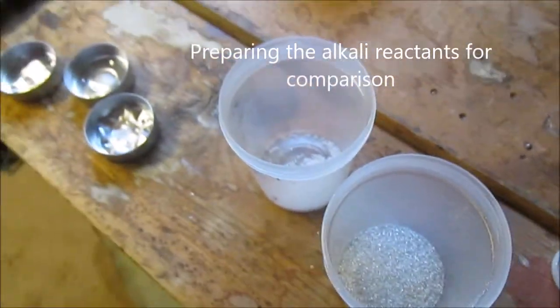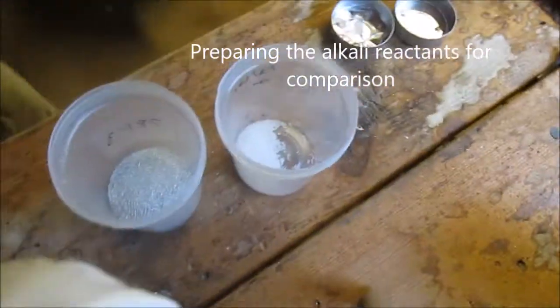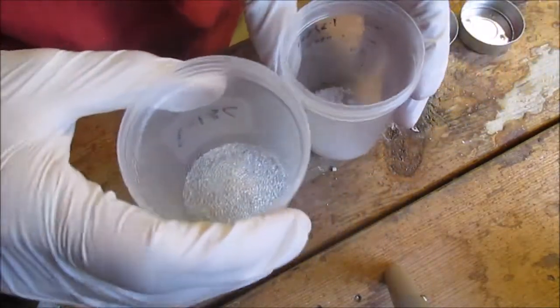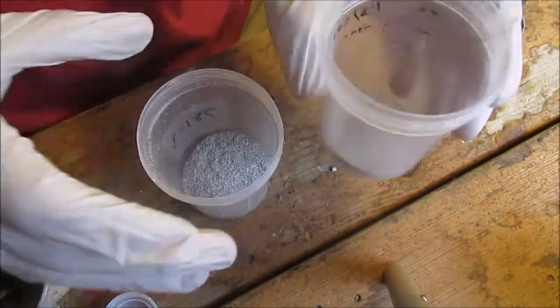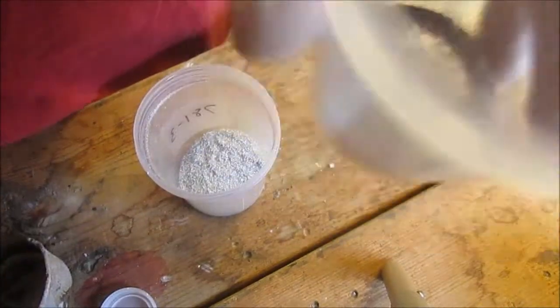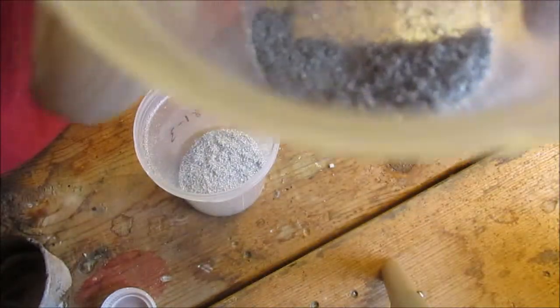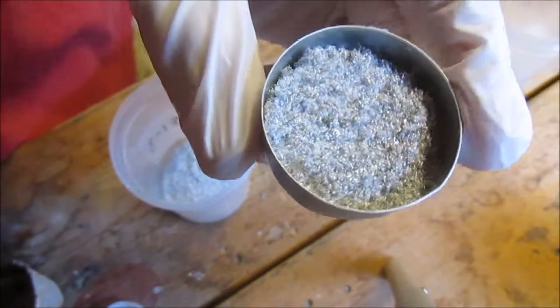So first I'm just going to mix some magnesium in with my sodium hydroxide. You're supposed to make a ratio — I think it's 5 to 8, 8 being the magnesium, 5 being the sodium hydroxide — but I'm not really going to bother with that today. Just mix this. Well, that's about mixed. Can't really distinguish any particulate from another. And now I've got it in a little pan, so I'll burn that.